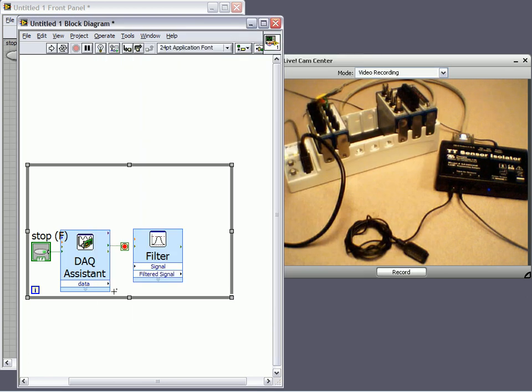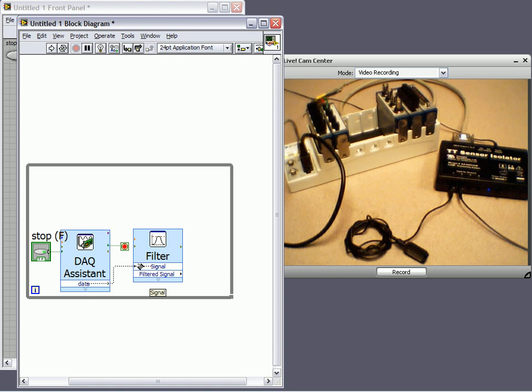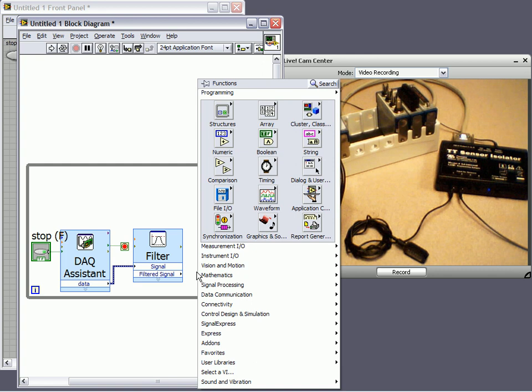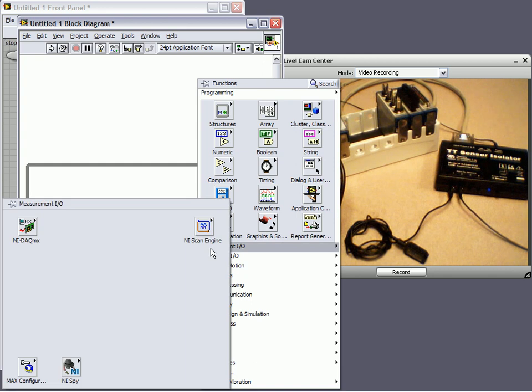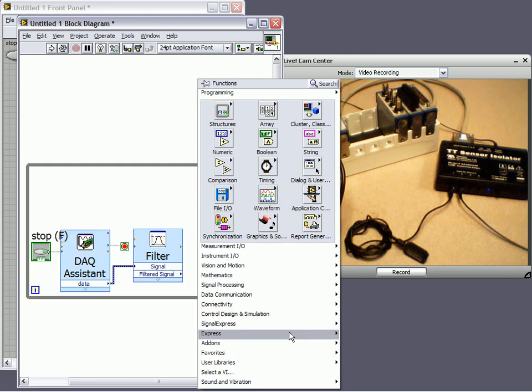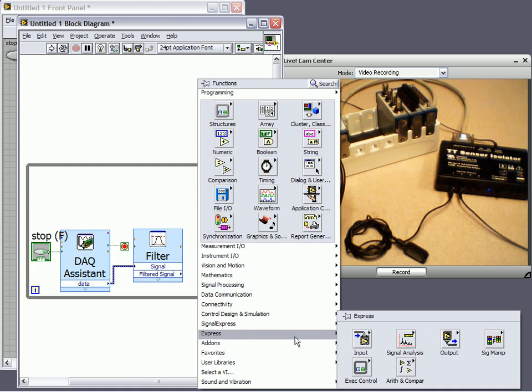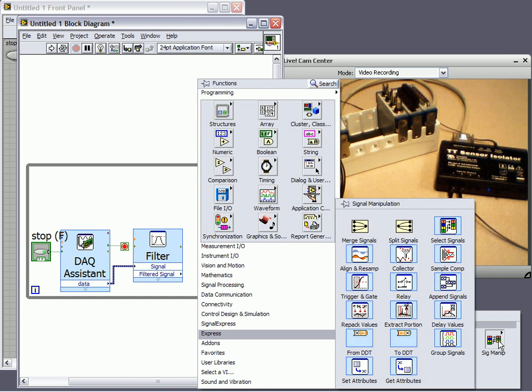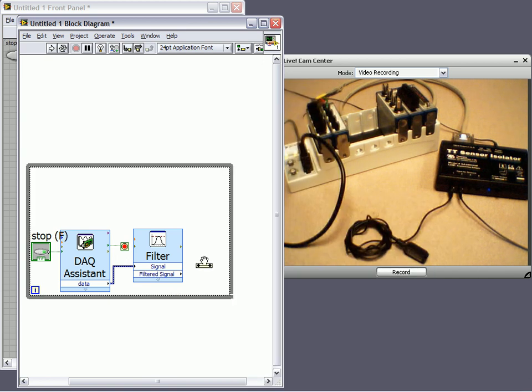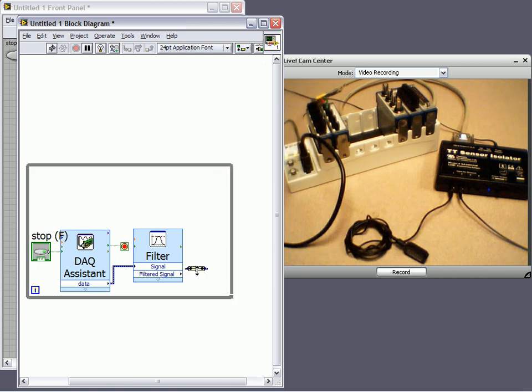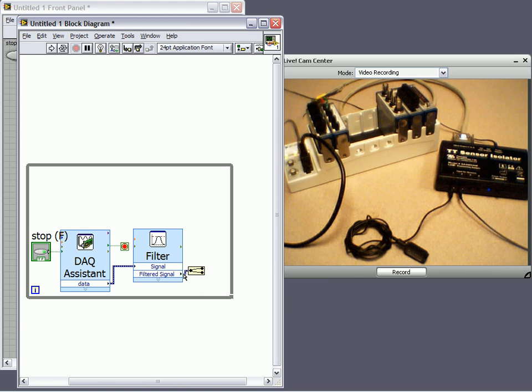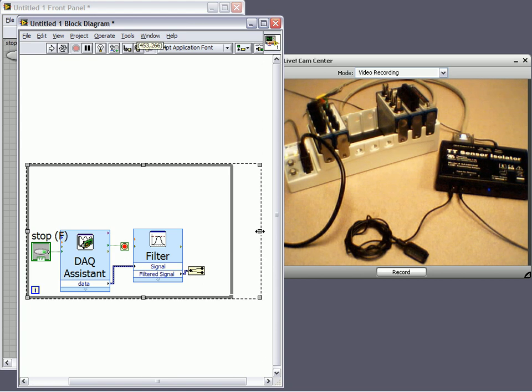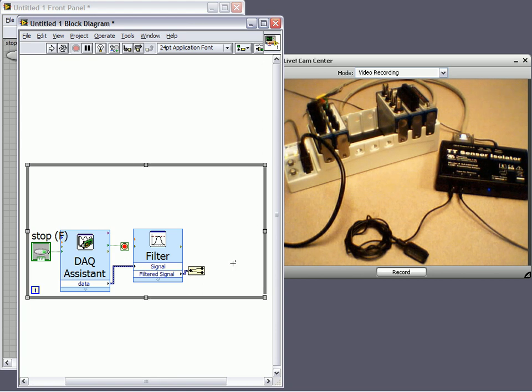And now, as I wire my data that I've recently acquired into my Filter Express VI, that filtered signal is going to exit with all of the high frequency components removed. Now, let's go ahead and split this signal. Remember, I'm acquiring two channels of analog input. I would like to split these so that I can display them on different charts.